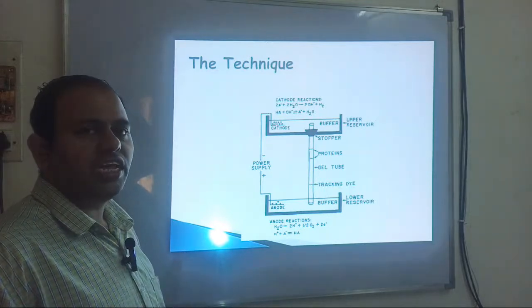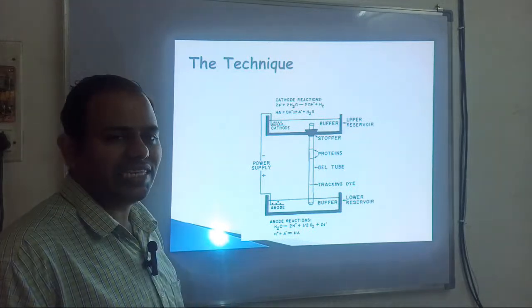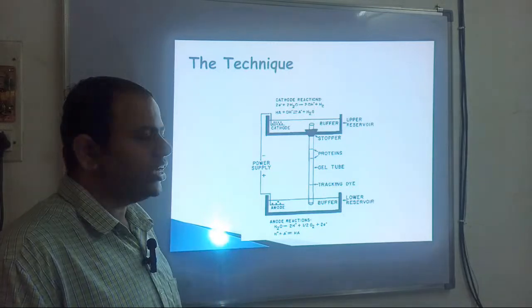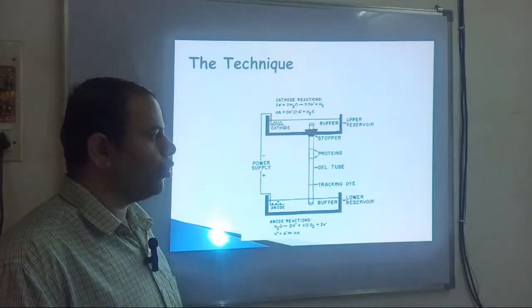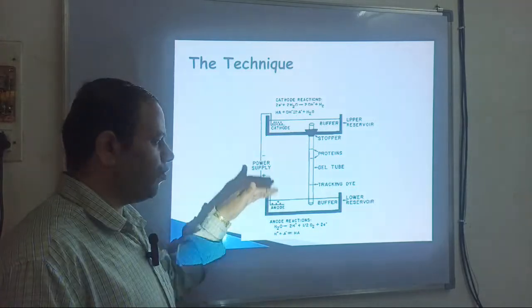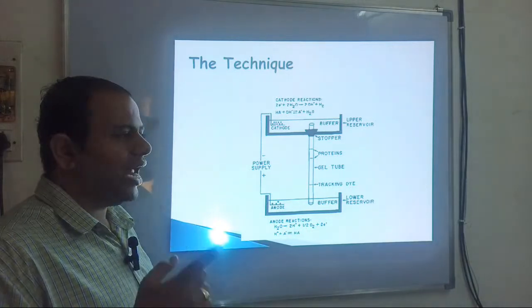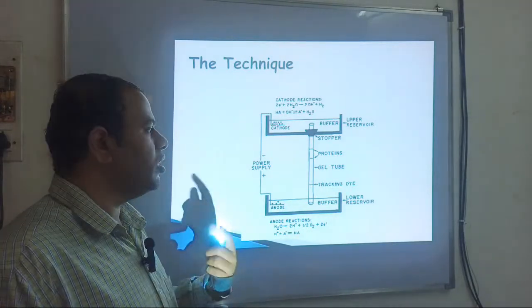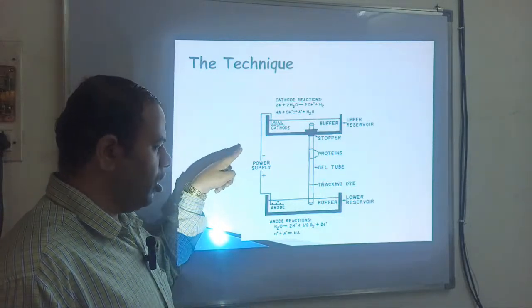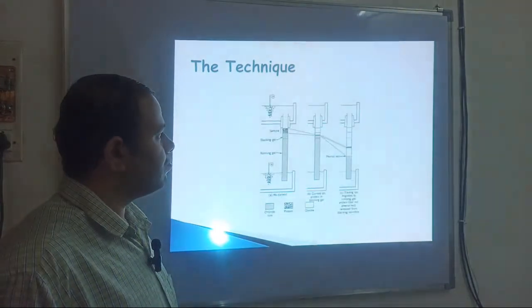So in such a case, the proteins are supplied with the negative charge using molecules such as SDS, that is sodium dodecyl sulfate. Okay, so it is an anionic detergent and it gives the negative charge to the protein molecule, so that they can be easily separated in the electrophoresis assembly. So remember, the biological molecule, such as DNA and protein, should have a negative charge when it has to be separated or moved towards the positive charge.